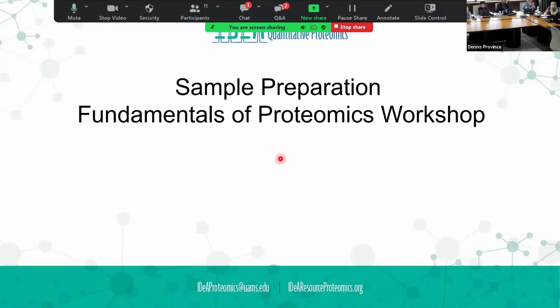There are certainly proteins that are going to bind to those abundant proteins and be depleted. Everybody's always worried about that. I'm more worried that if we don't deplete, we're going to identify only the abundant proteins. You can always worry about something, but I don't worry about that. We have some researchers that want to then reanalyze the depleted proteins. That's something we try to talk people out of, but I know some people have done this. There are certain cases where you're going to find an interesting protein that binds to albumin, but that's a technically very difficult experiment.